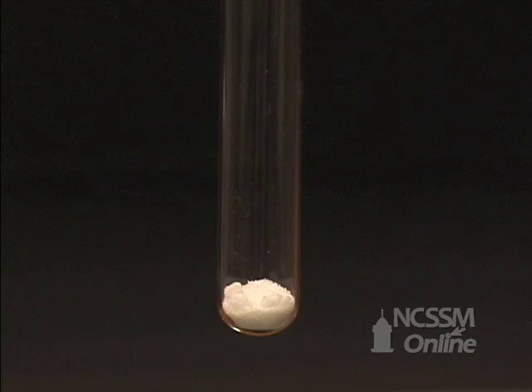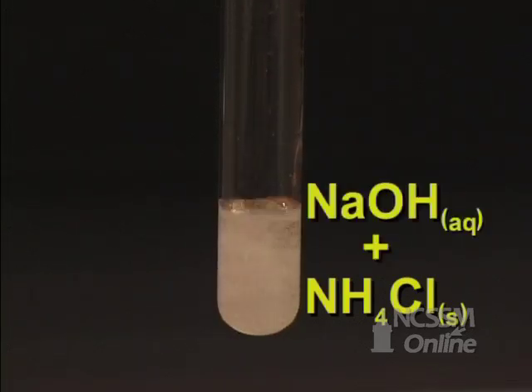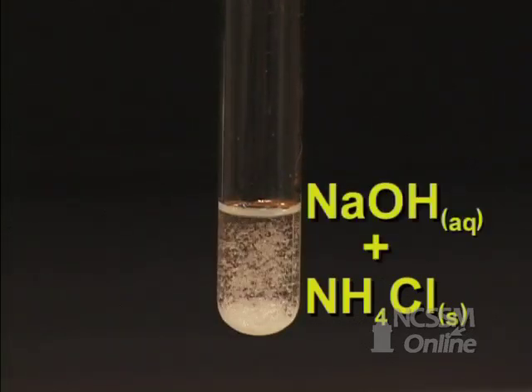In the double displacement reaction of an ammonium compound with a hydroxide, we will place a small amount of solid ammonium chloride in the test tube. We will add some 6 molar sodium hydroxide solution. The test tube is warmed.